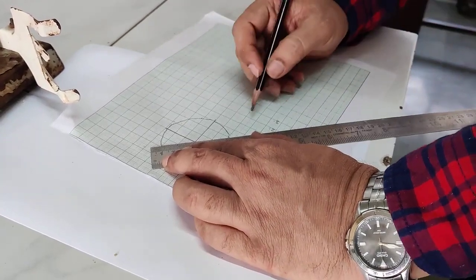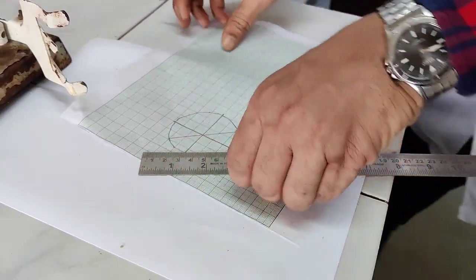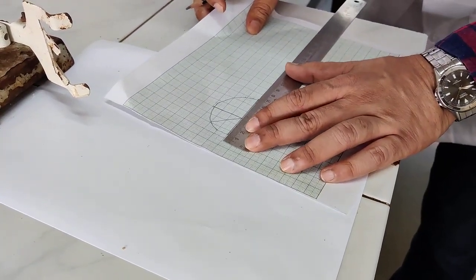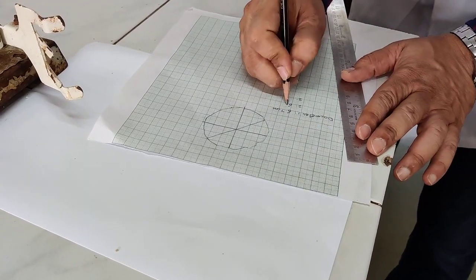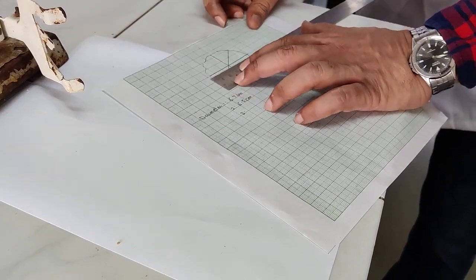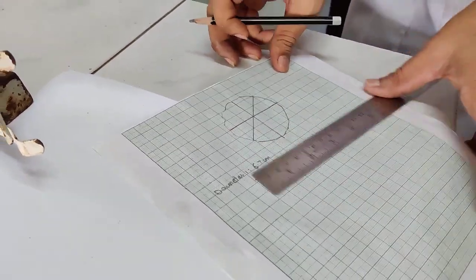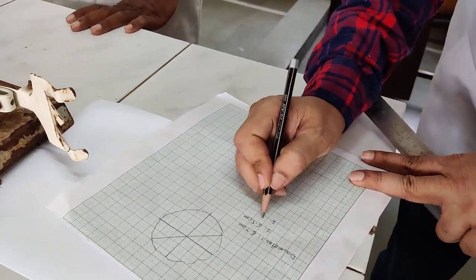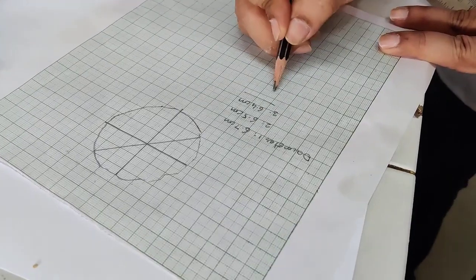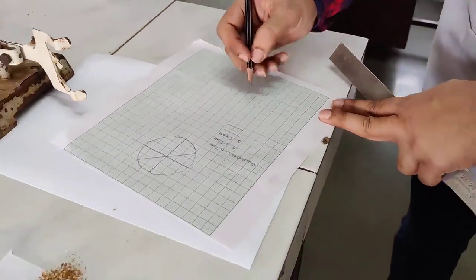is 6.7 centimeter, 6.5 centimeter, and 6.4 centimeter. I am going to find out the average, the mean of it. So that is going to give me the average diameter.